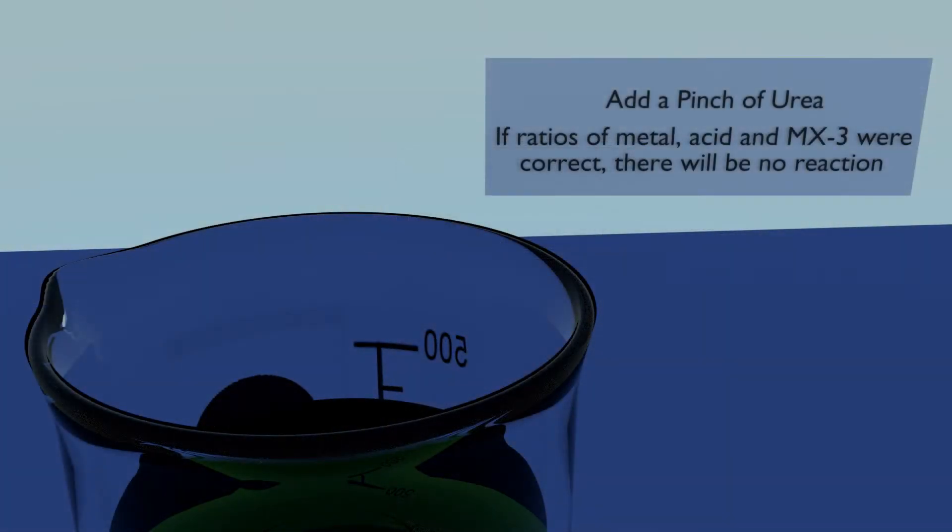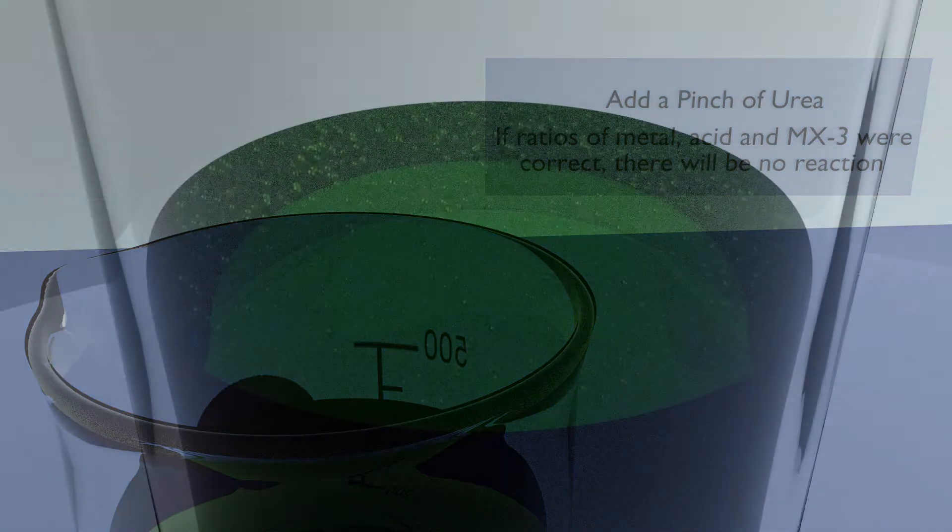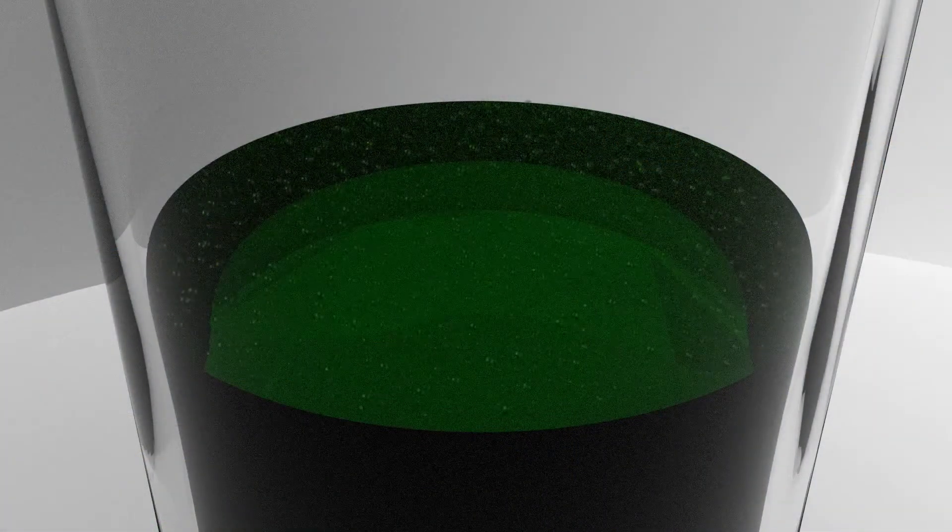Add a pinch of urea. If your ratios of metal, acid, and MX-3 were correct, there will be no reaction. However, if the urea fizzes, then slowly add more until there is no reaction.